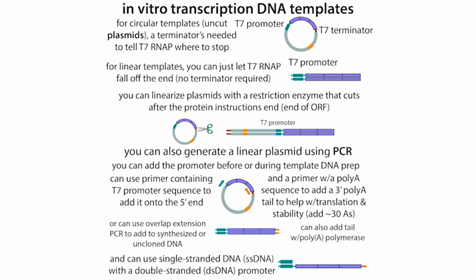And so there are ways that we can get this synthetic RNA to be made in a way that's not that solid state synthesis. So this is the way that's more like what happens in your body, but it's happening in a test tube. And so there are ways that we could do that for both DNA and for RNA. And this is going to be good for longer sequences. And it's a lot more simple because we're making enzymes do all the work for us.